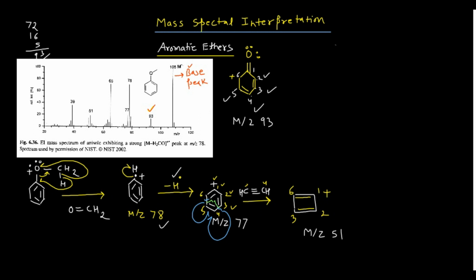And if you subtract your 65 from this 93, what will you get? 28. That means you need to remove 28 mass units from this particular fragment to get the interpretation of this 65. What combination can make this 28? Carbon and oxygen. Carbon is 12, oxygen is 16. If you add, then it is 28. That means you need to remove CO, the carbonyl group, from here. So I have made the calculations. I have to remove this carbonyl from here, as I have explained.